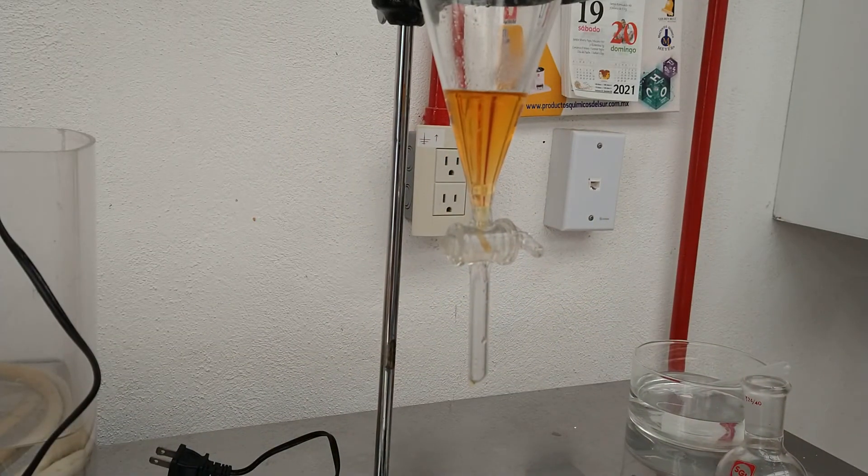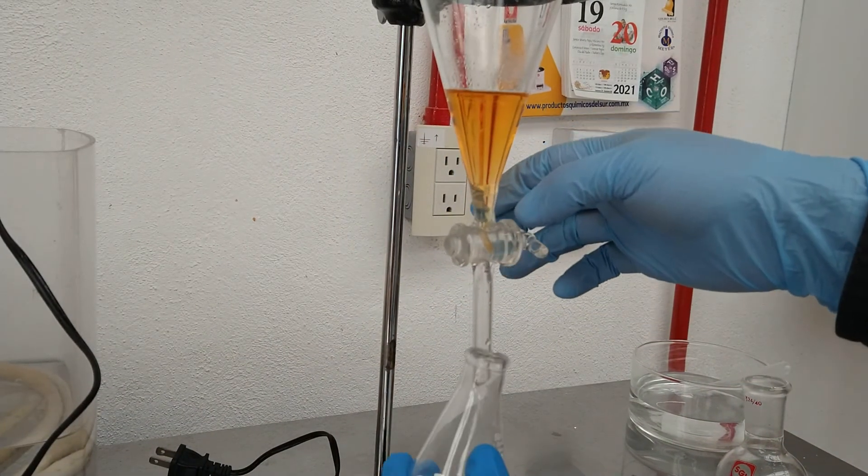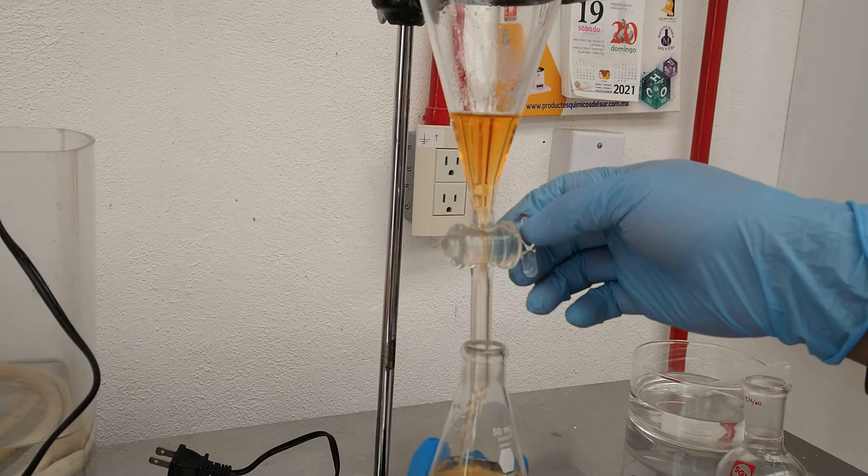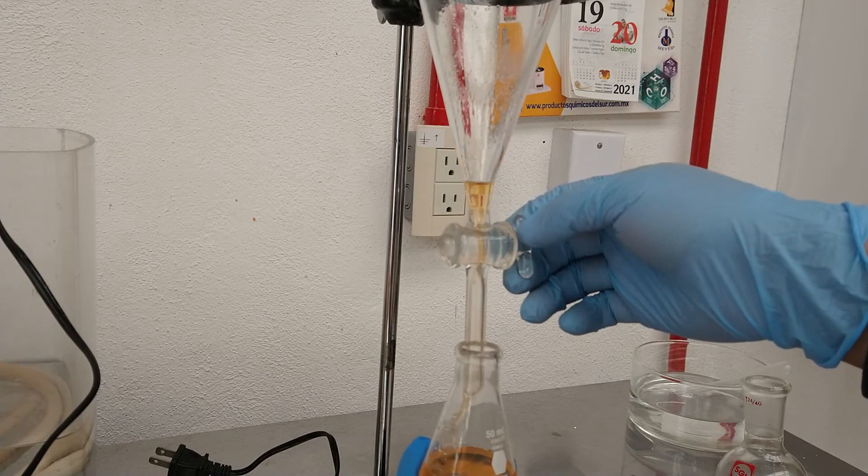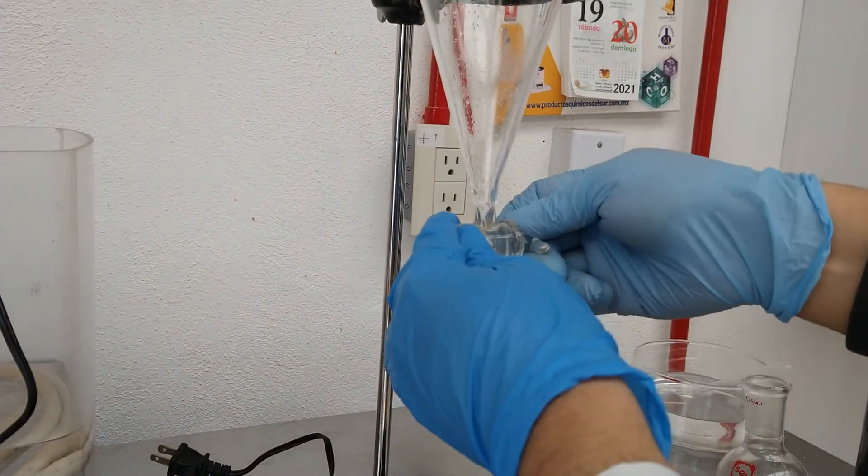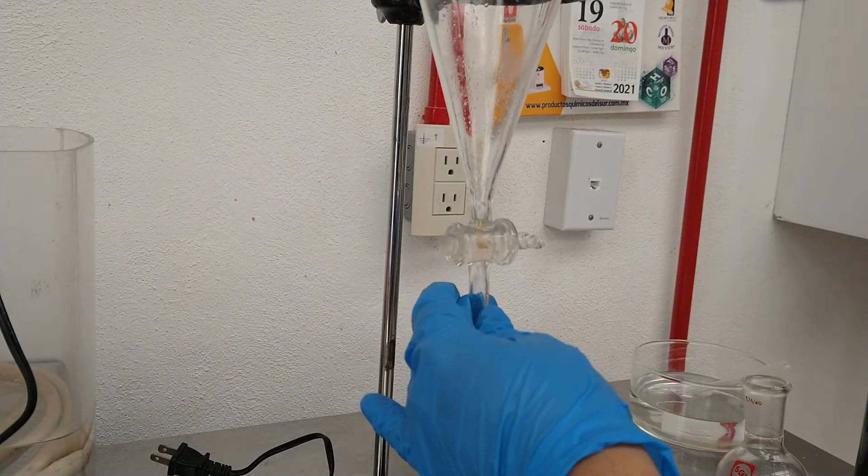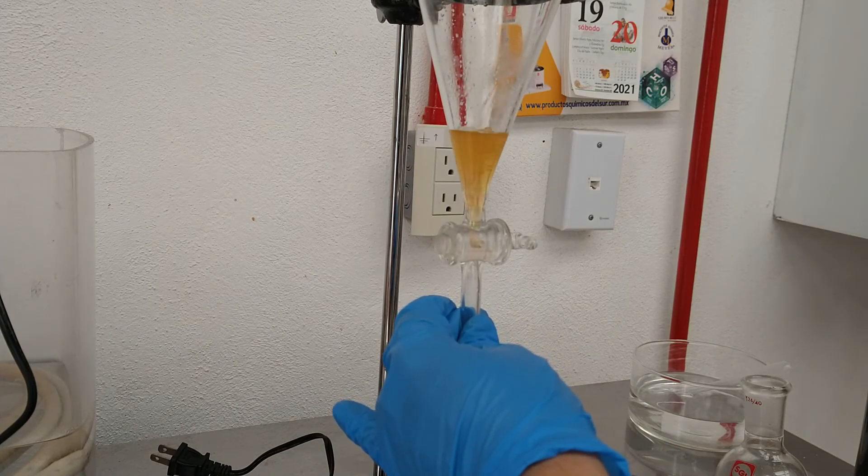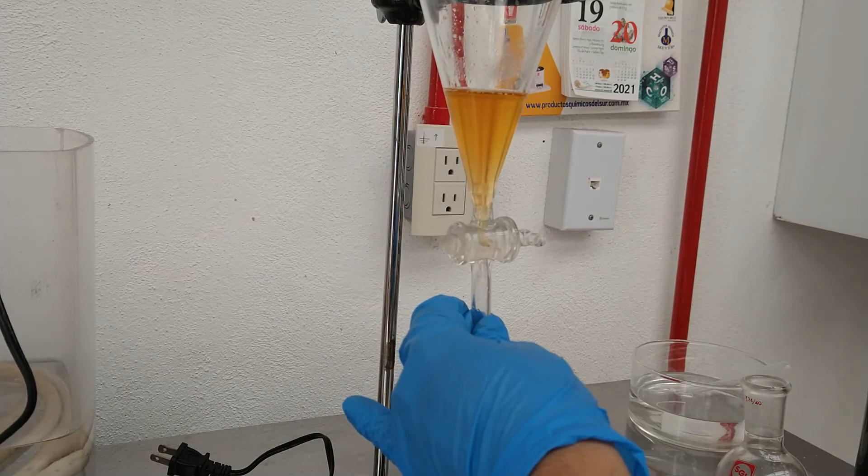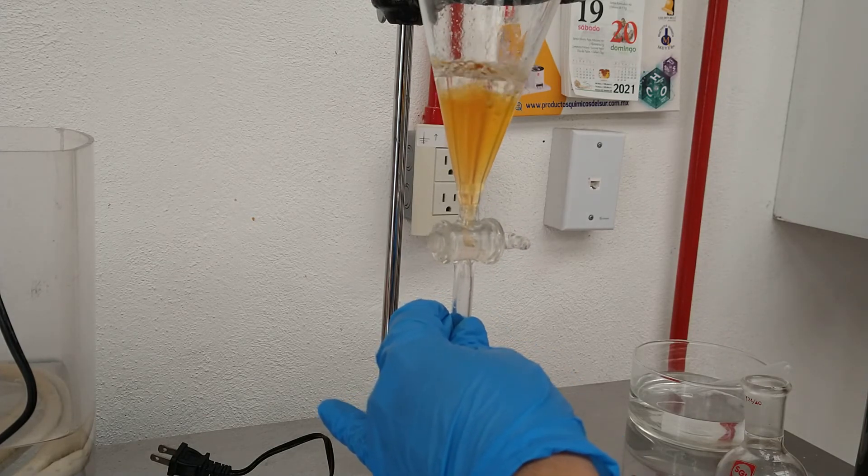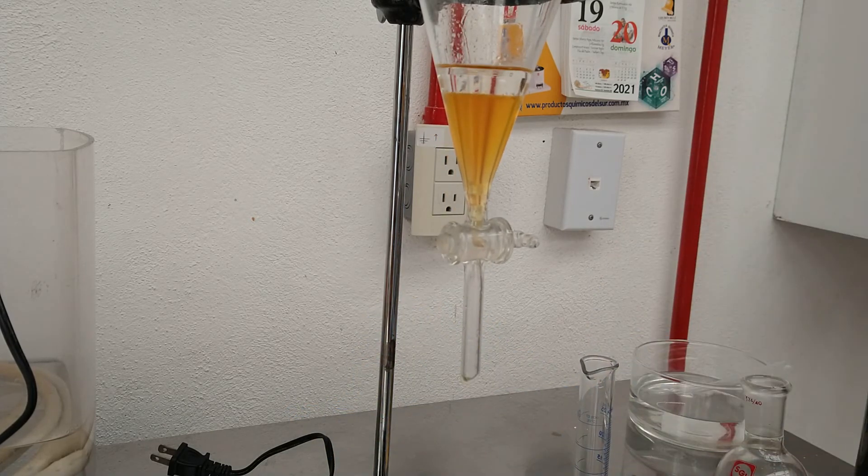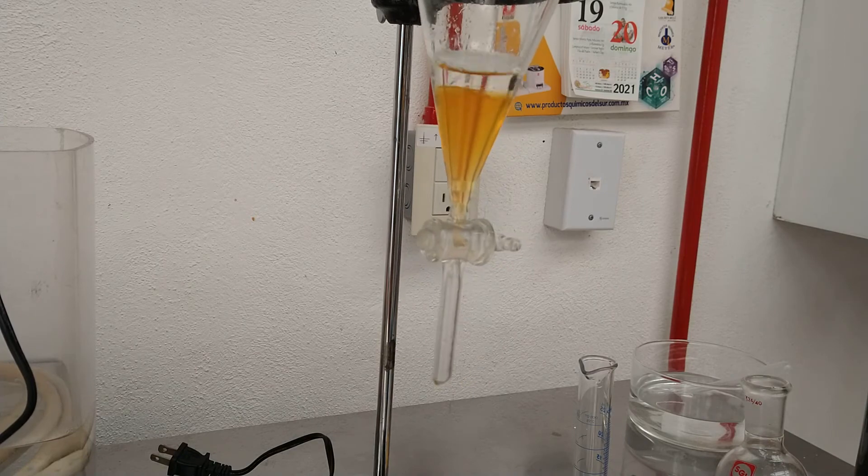We save and drain both layers. The organic layer we decant over some calcium chloride. Then we transfer again the aqueous layer to the separation funnel and add approximately 15 ml of ether to extract the remaining ethyl acetoacetate that stays in solution in the water.